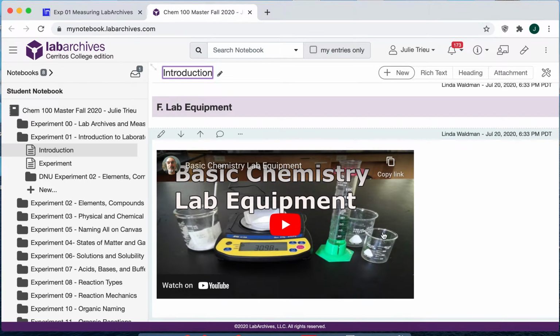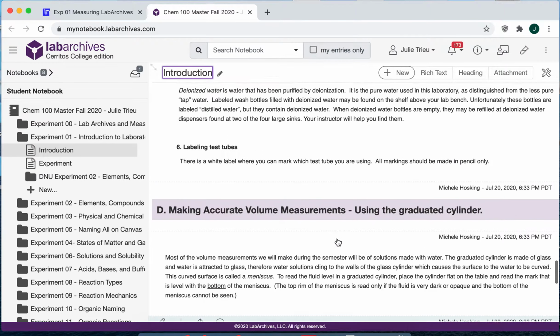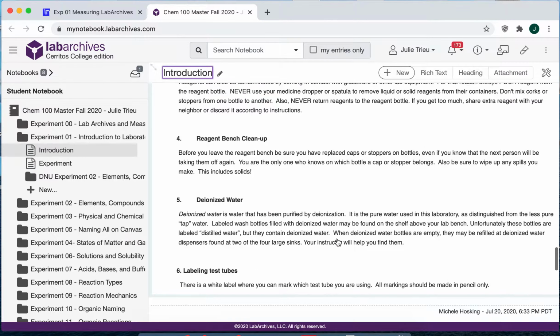For example, I'm gonna show you the picture of this piece, and you know it's gonna be the beaker. And this is the balance, and for example, this one is the graduated cylinder. So make sure you watch this video to know the name and the shape of any chemical equipment we use in lab most of the time, and you're gonna be able to recognize them in the lab quiz.